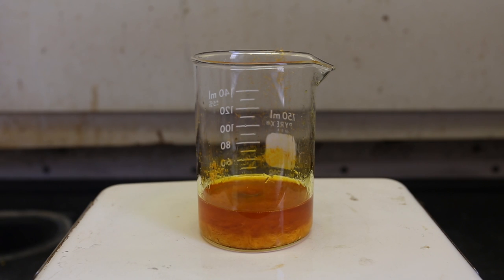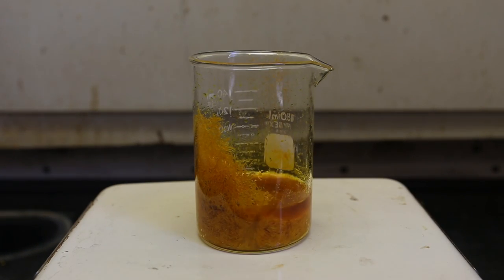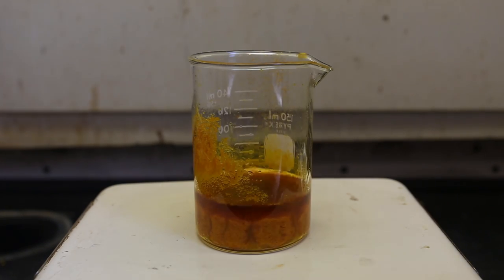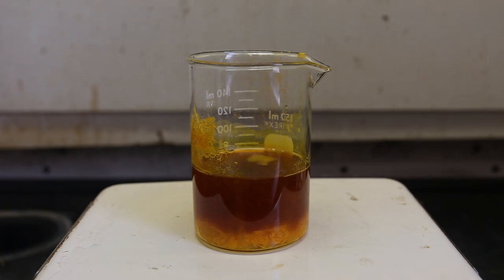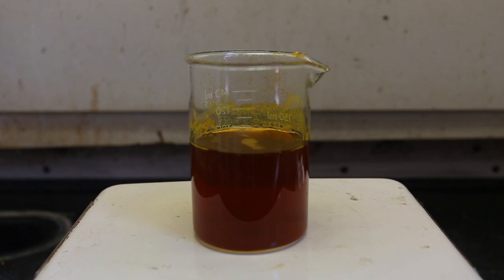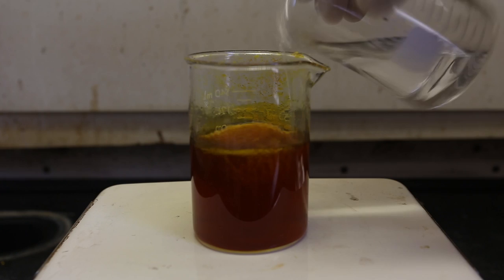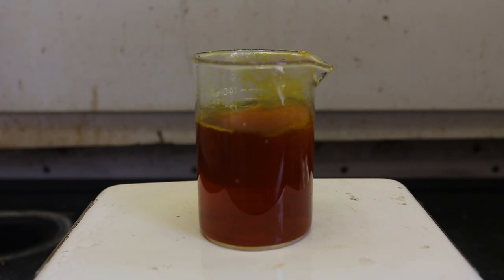I did my recrystallization in anhydrous ethanol, however, 95% ethanol should suffice. The recrystallization using ethanol was much easier, faster, and will provide a better, cleaner product than the water recrystallization. A lot less ethanol is required, but the most important point is that the ortho isomer is soluble in ethanol, whereas the para isomer is only sparingly soluble. This means that only the para isomer should recrystallize, whereas the ortho isomer should stay in solution.